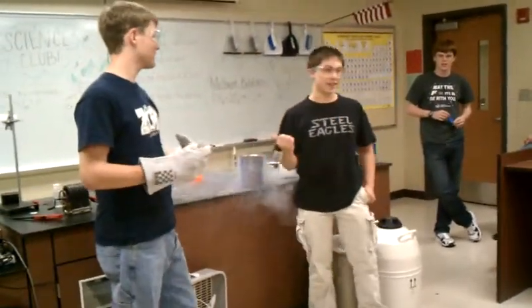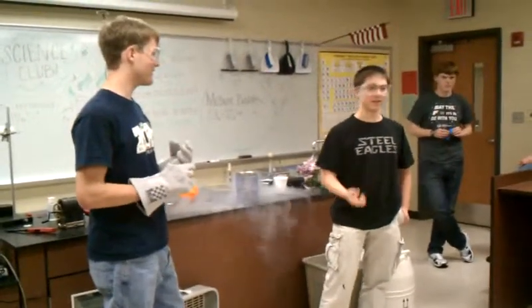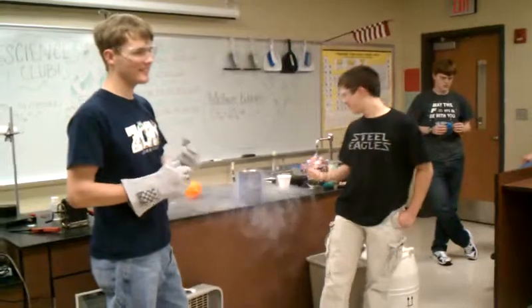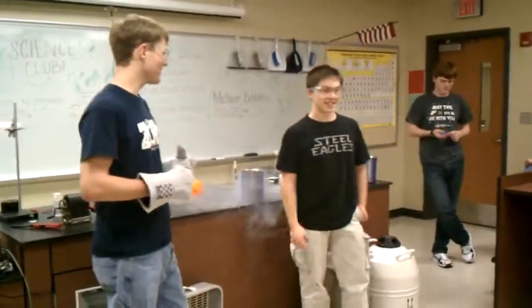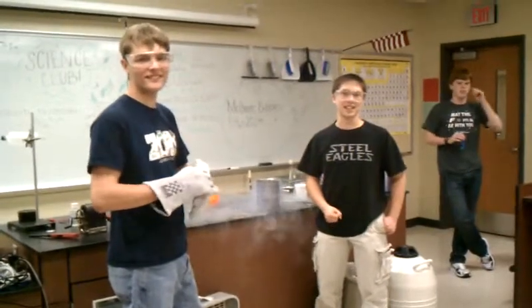Now, if I left it in there for maybe 15 seconds, I would be able to take my finger and smash it open like that. This is negative 196.